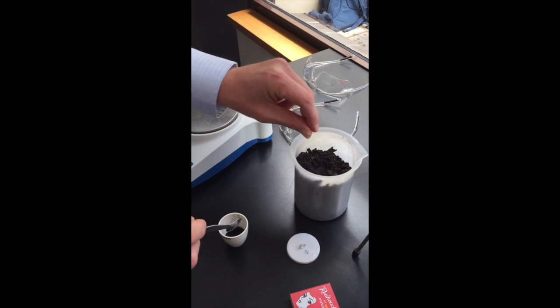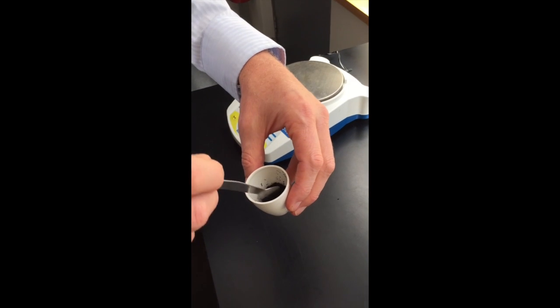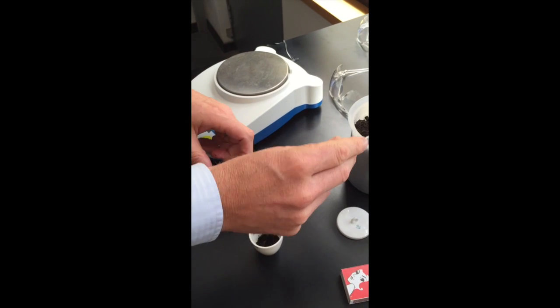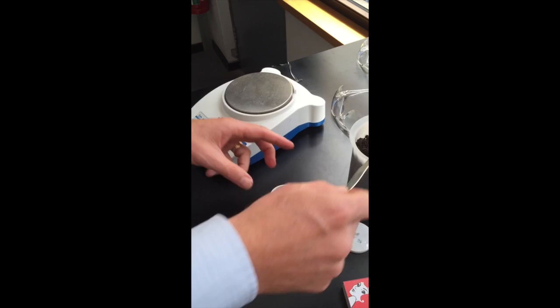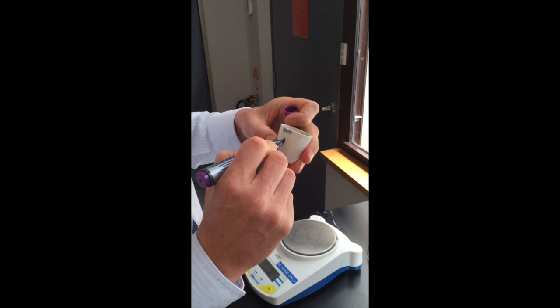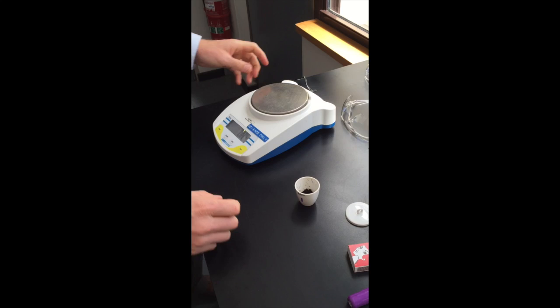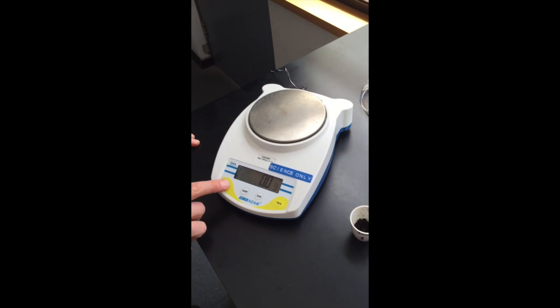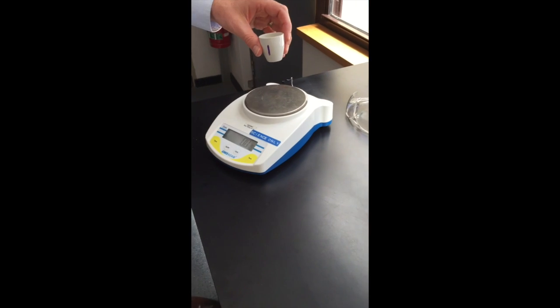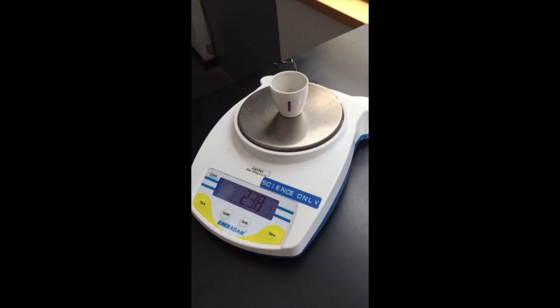We want to test for organic matter that's actually been decomposed and has become part of the soil, as opposed to sticks and leaves that are just sitting in it but aren't part of it yet — that's why we need to separate those out. Once your sample is in the crucible, label it, as we're going to place these in an incubator overnight to dry out the soil. Then weigh it and record that down in your notes.